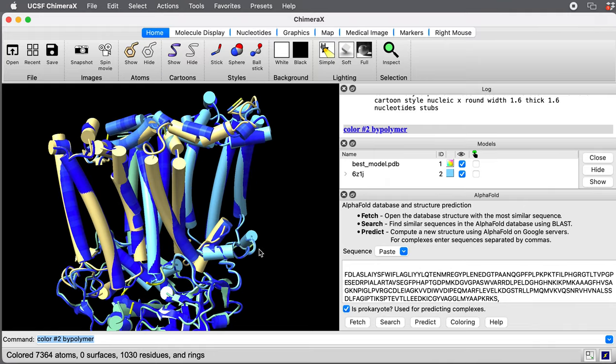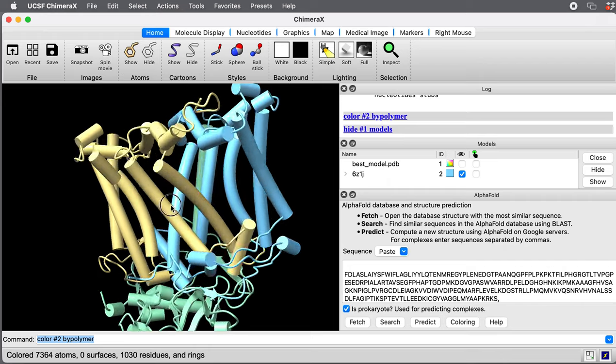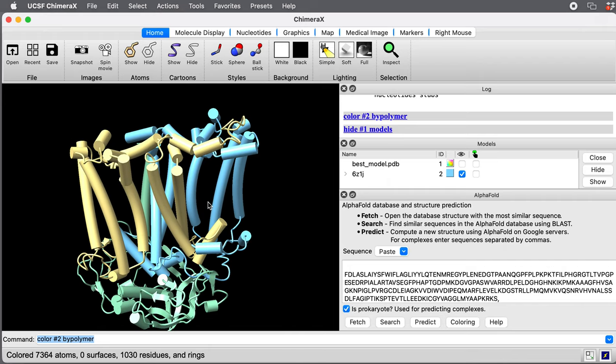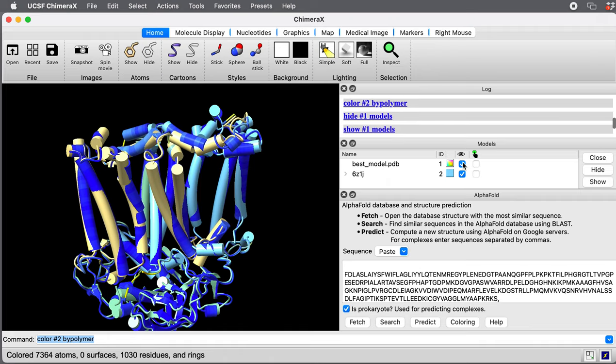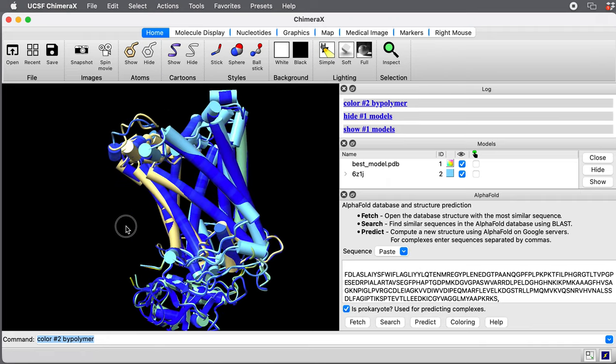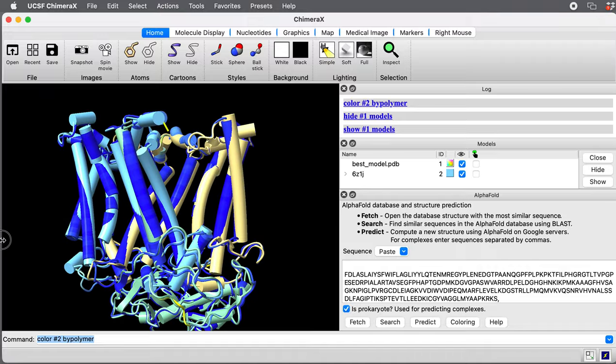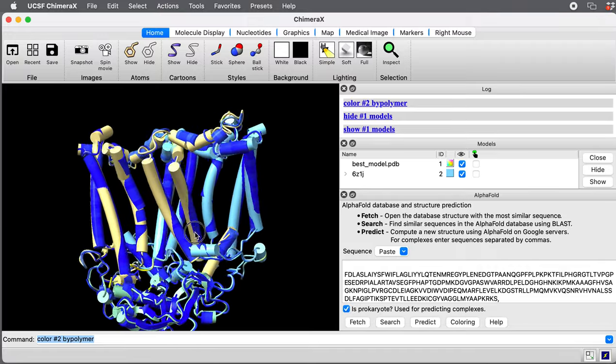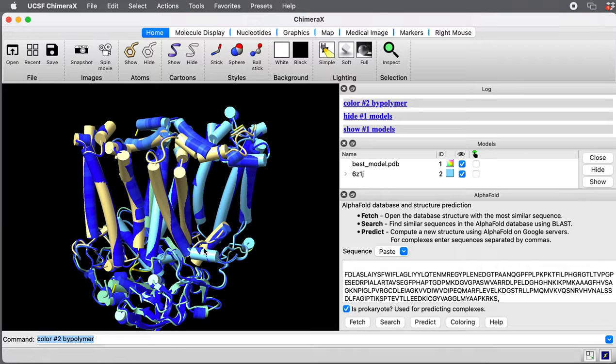Here if I hide the AlphaFold model, here's what the experimental structure looks like. And then the overlay of the AlphaFold model. So incredibly close in this prediction. That's not always the case.